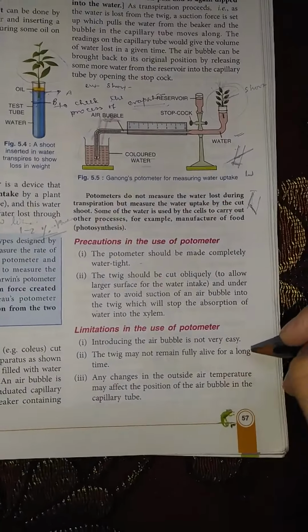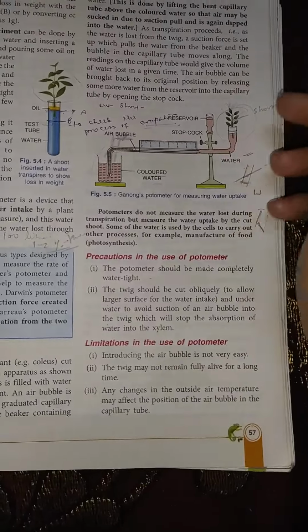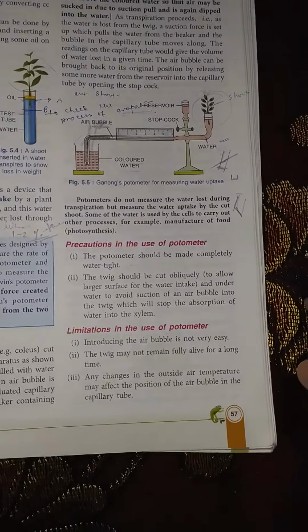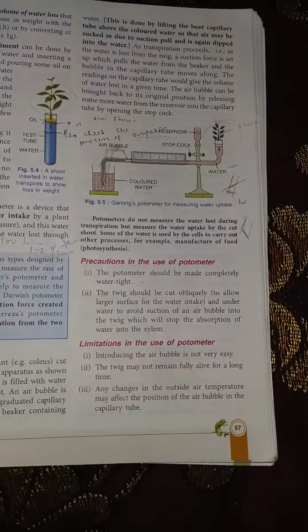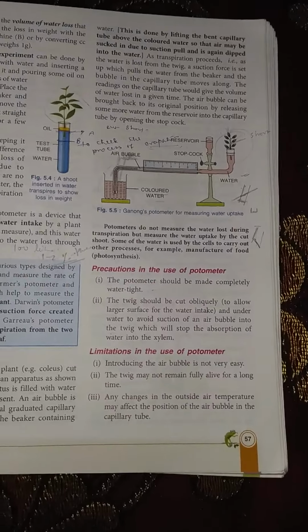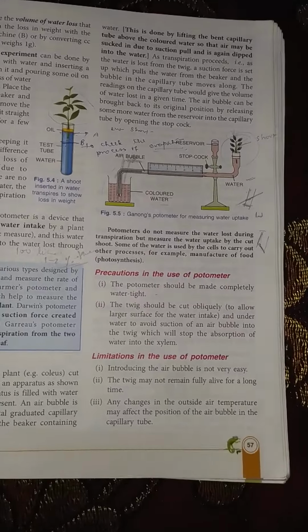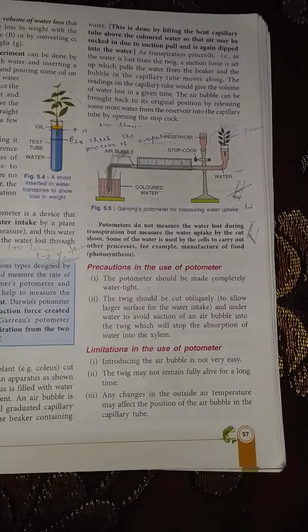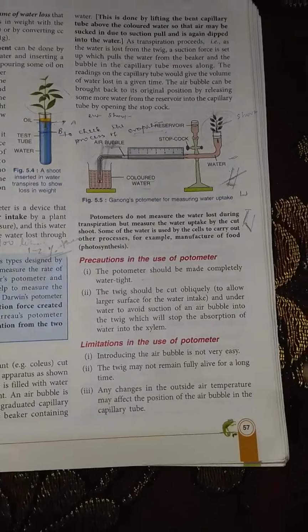Now, the shoot may not remain fully alive for a long time, since this is cut from the parental plant. So this shoot will not be alive for the maximum time or a long time. 2 घंटे 3 घंटे 4 घंटे के बाद ये क्या होगा, सूखना चालू करेगा, it will die. So experimental time क्या होगा, बहुत ही लिमिटेड, 1-2 घंटे या 3 घंटे का ही रखना पड़ेगा.